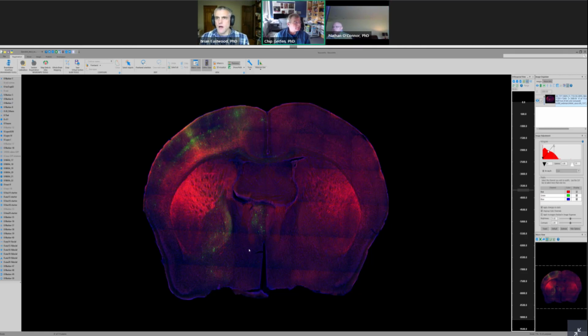Was there a question there? Yeah, so I think the important thing there is to include everything in the focal stack, that lets you focus on it during deep focus, right? If it's never imaged in focus, we're not going to be able to recover the focal information from that.